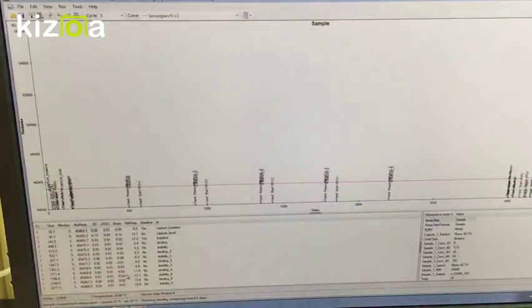So this will open the window that would display everything that is currently happening right now. If you actually see in the bottom left, it says not connected right here. So right now that system is connecting. Once it's connected, you can actually see it says online computer 1 right here.